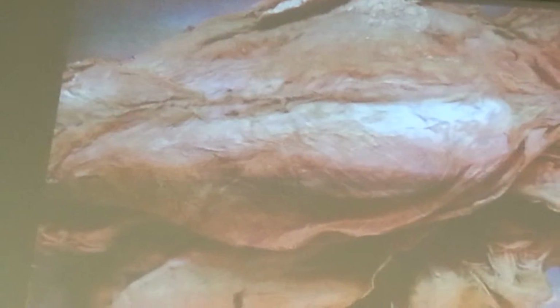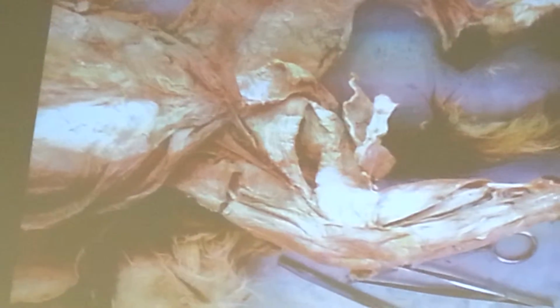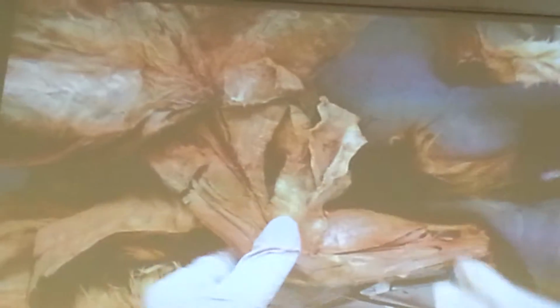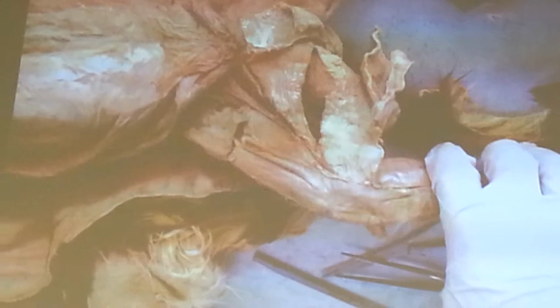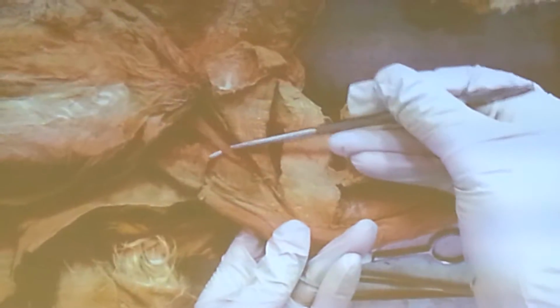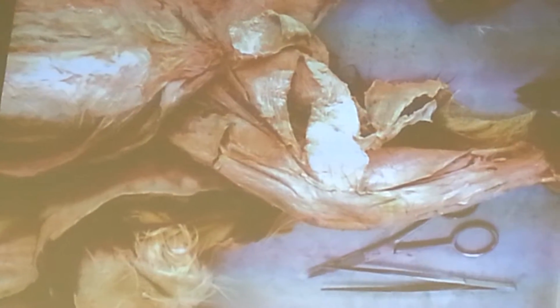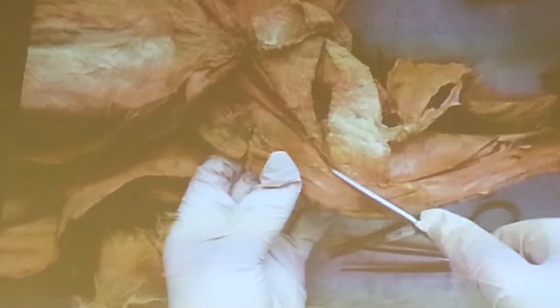Alright, let's go over leg 2 very rapidly, and after that we go to the cat. Ready? So on the anterior of the cat, we have the femoral artery and vein. Just put away fascia, fat, everything, and we find these femoral artery and vein in the middle.